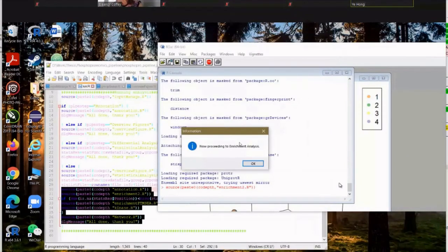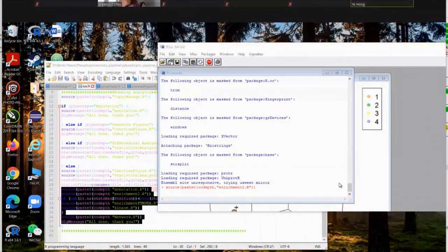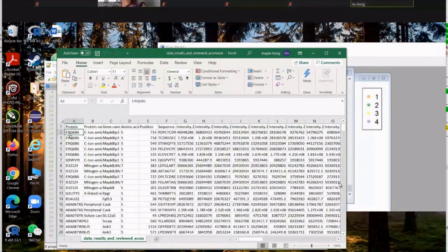So this is going to enrichment, and if you just click OK, it should do everything on its own. You don't have to make any choices here. For this one, sometimes when they're not reviewed, you look into a reference database. The site position that they listed is from the same protein, but the sequence is from a reviewed protein's extension sequence, so it doesn't match up when you search the site positions in a database.